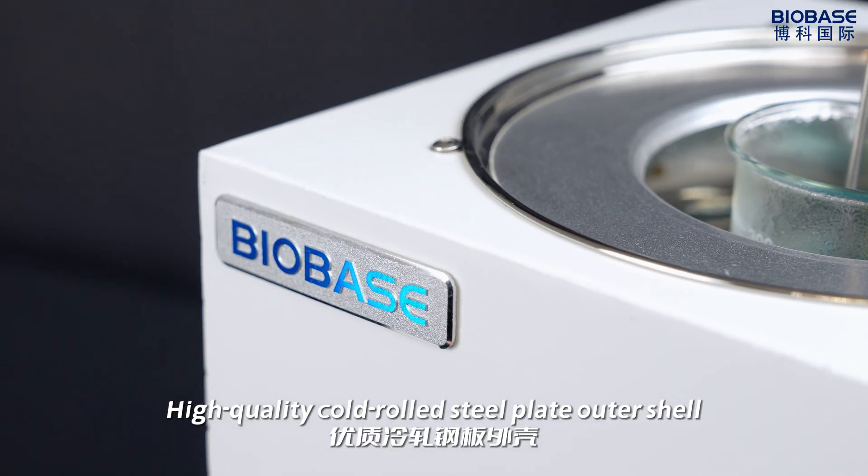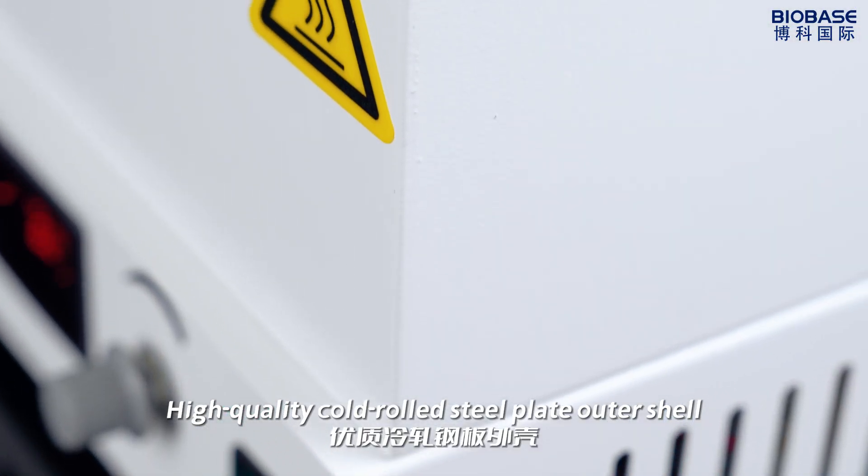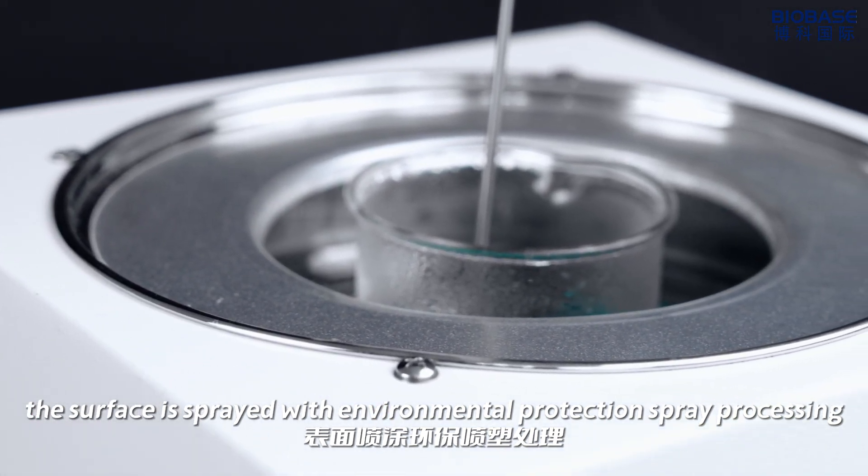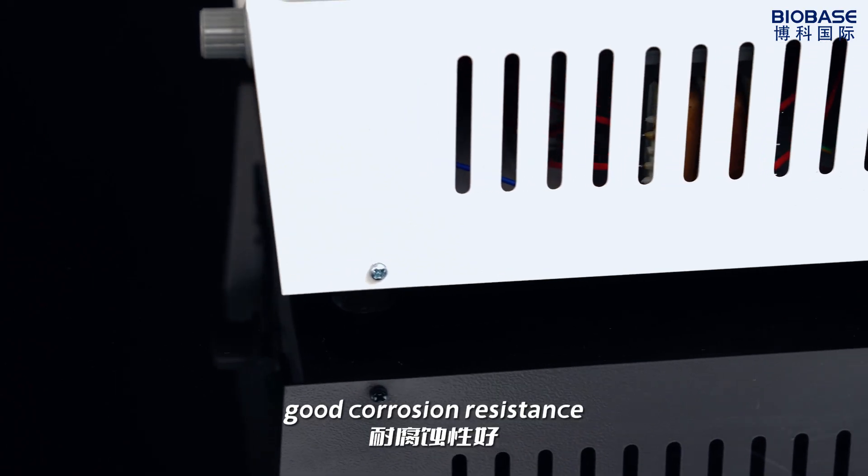High-quality steel plate outer shell. The surface is sprayed with environmental protection spray processing, providing good corrosion resistance.